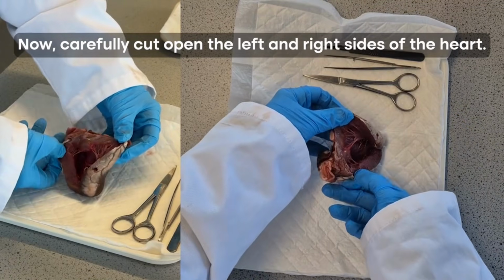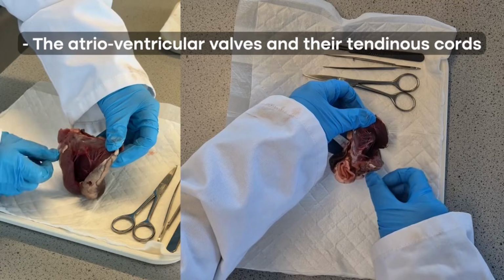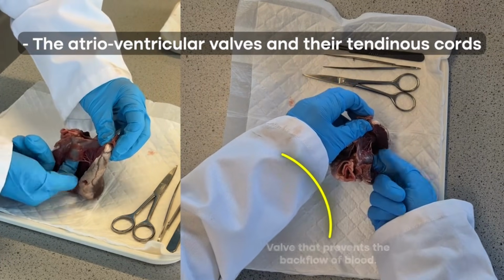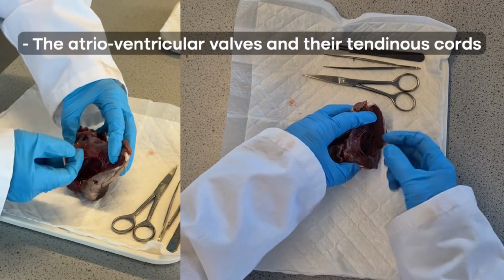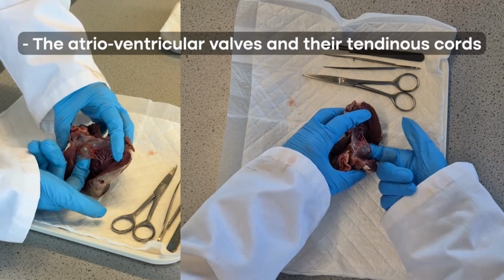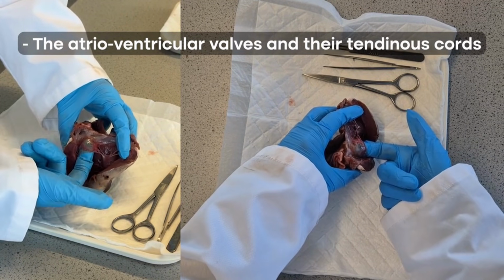We've now cut in so we can see here was the atria. This is the atrioventricular valve. We imagine when it was all round like this, it was all connected. So this is the valve that prevents the backflow of blood from the ventricles when they contract up into the atria. And you can see it's a really thin layer of tissue. And I do show the students that it is really thin, but you can see it is tough. I'm pulling on that quite hard.